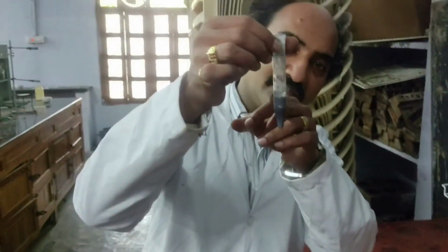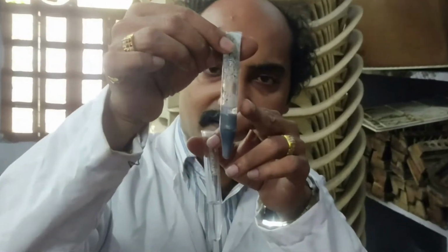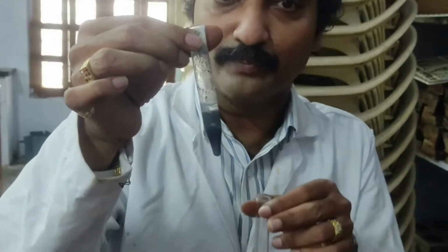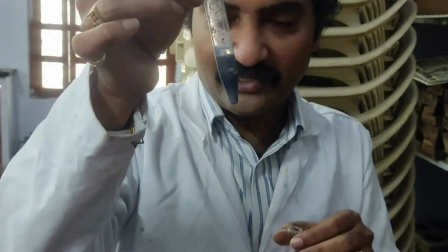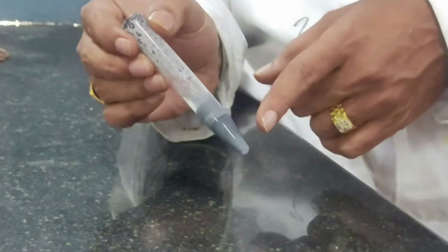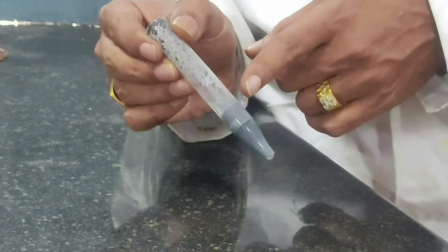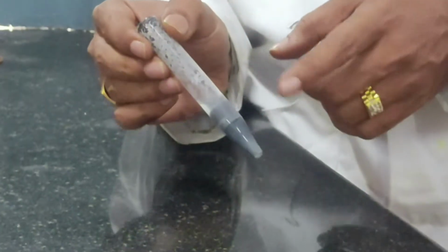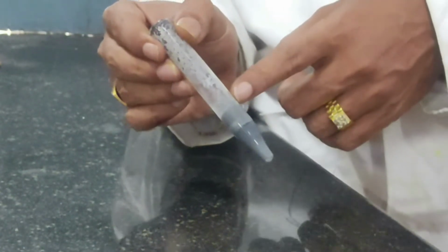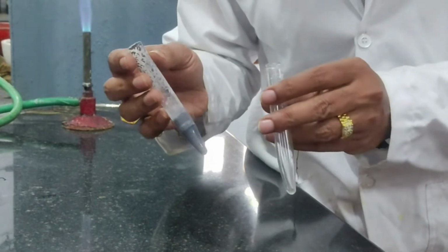See how beautifully the residue got separated. So this is the residue and the centrifugate. In this case we are discarding it, but it should be tested for fifth group actually. This residue contains 4th group cations, therefore it must be tested for that, and the centrifugate is to be decanted. It is discarded in the present situation, but we have to actually perform 5th group cations with that centrifugate. Now I am decanting to separate the centrifugate from the residue.